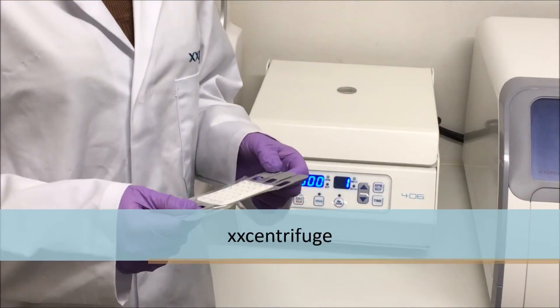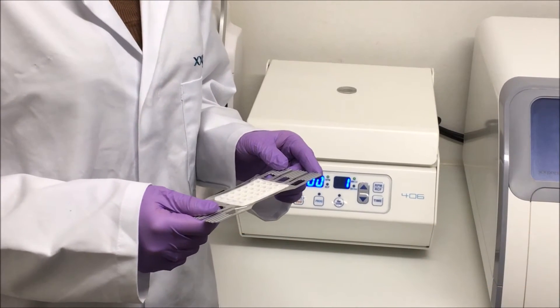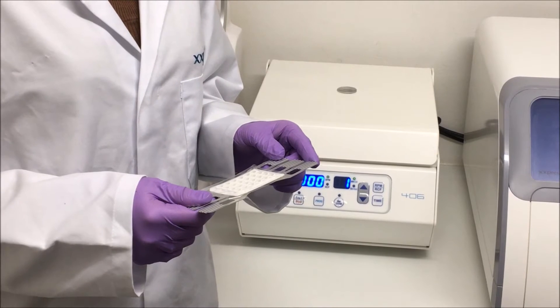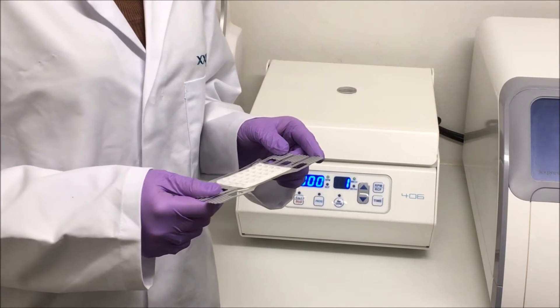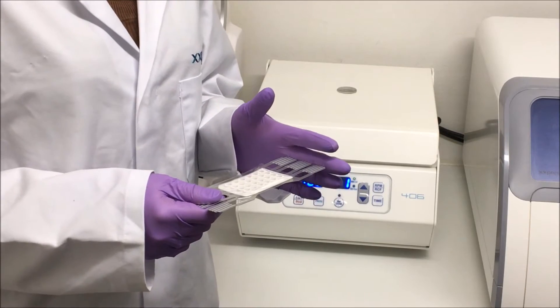I now need to centrifuge my X-plate and this is done at 4000 RPM for 30 seconds. It's done to thoroughly mix my reagents and also make sure that they're well pressed onto the bottom of the well for optimal heat transfer.